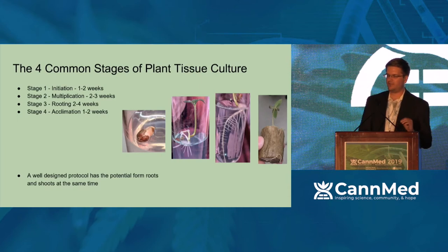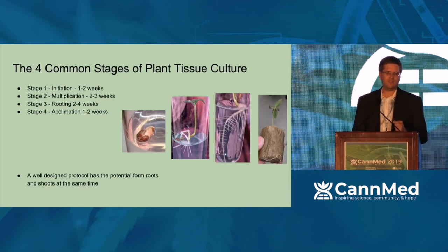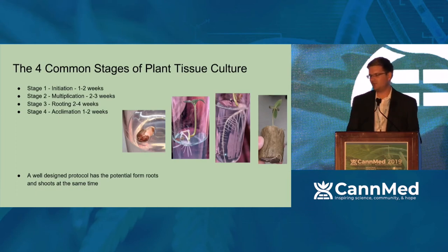That rooting stage I need to talk about really quickly, and I'll get into this as well. It's very hard to establish a set rooting protocol for every single cultivar of cannabis. I've read some literature talking about hops and people trying to do indirect cell organogenesis, where it only works some of the time on some cultivars, but not all. And so you run into a lot of problems going down that path.